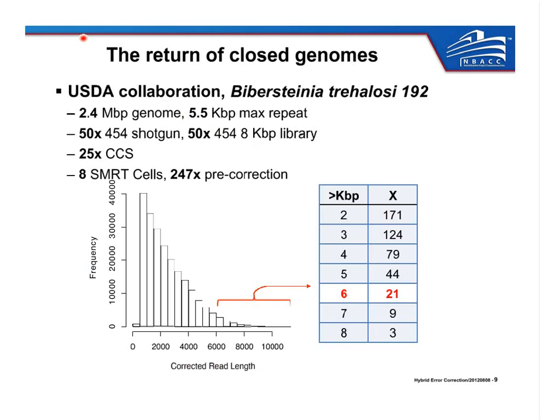And the reason that we looked into this genome was because this was one of the genomes that they were having the most trouble with. They were doing a large-scale study with several different strains, and they had the most issue with this assembly. And you can see that even when they did a 454 8K library, it didn't really assemble well, even with that data. So what we did is we used our correction pipeline.